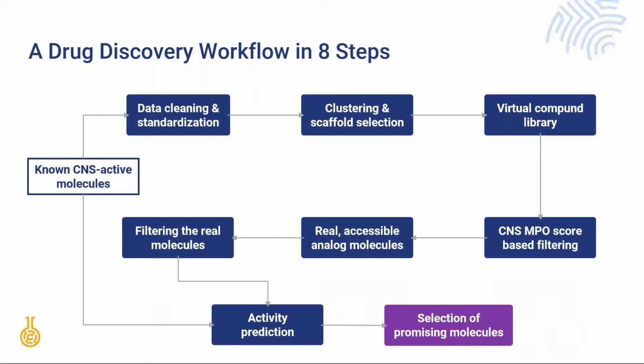Okay, and I guess you can also see my shared screen with the summary of the workflow that will be our topic today. This is what Bilal has presented yesterday as a summary: this drug discovery workflow in 8 steps.